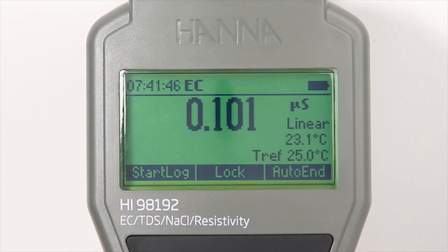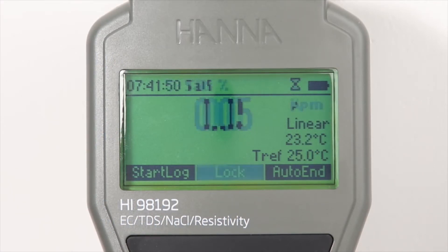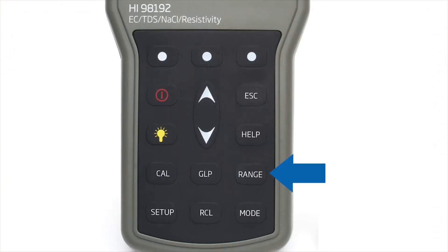To switch between EC, resistivity, TDS, and salinity modes, simply press the range button while in measurement mode.